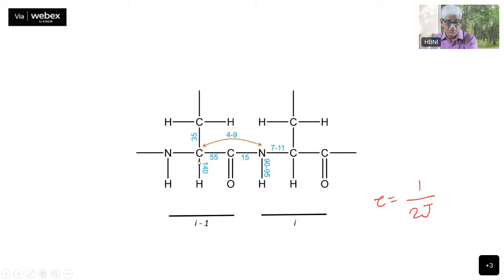And proton to carbon is 140 hertz, and this C alpha, C beta, this is the carbon-carbon coupling, is 35 hertz. These ones don't vary much. Therefore, it is easy to optimize your pulse sequences making use of these numbers.